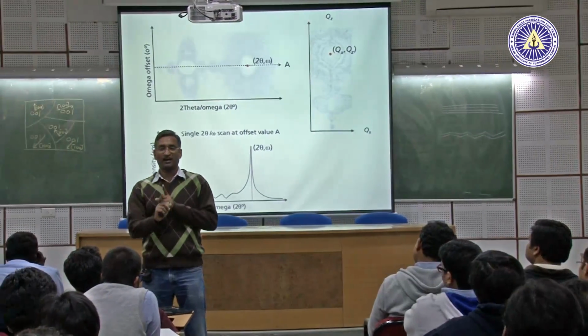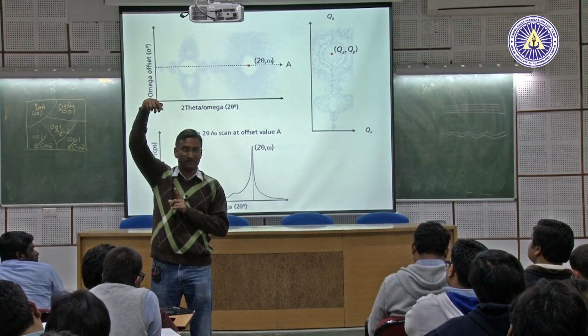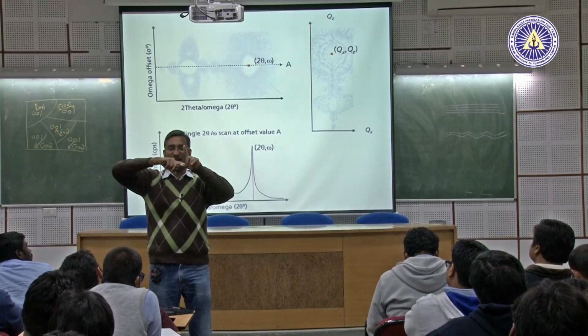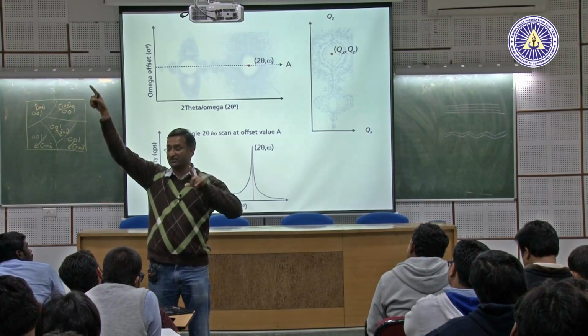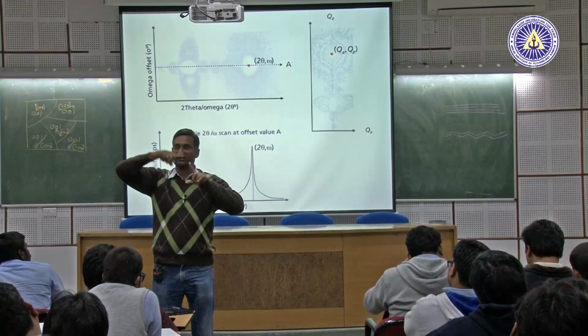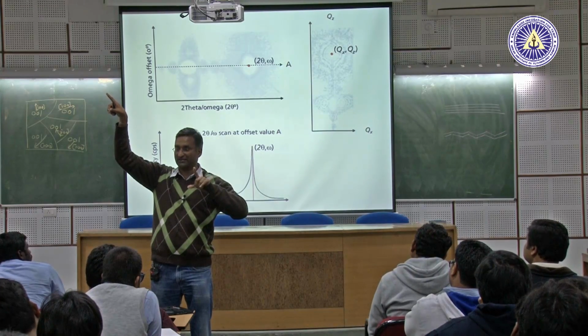If they are aligned in one particular direction, there is alignment along that direction. However, if one point lies here and another point lies here, by measuring the angle with respect to the origin, you can determine the misorientation between the sample and the film. So not only can you calculate the D precisely, you can also calculate the misorientation between the two spots precisely.